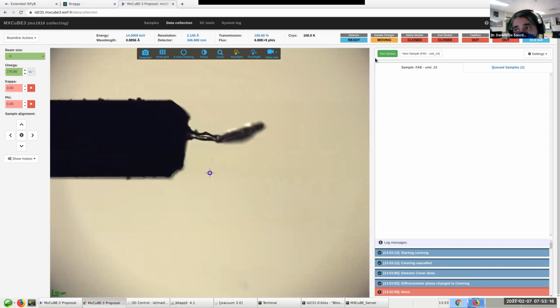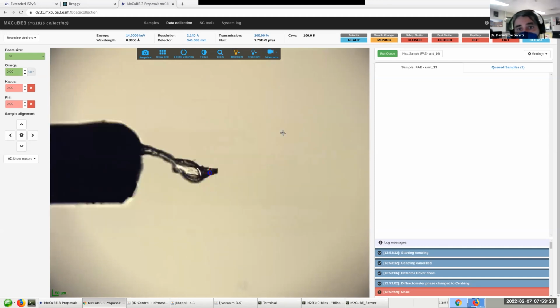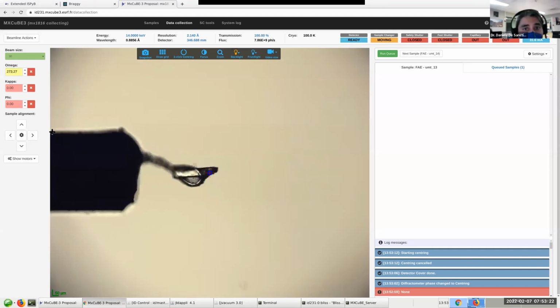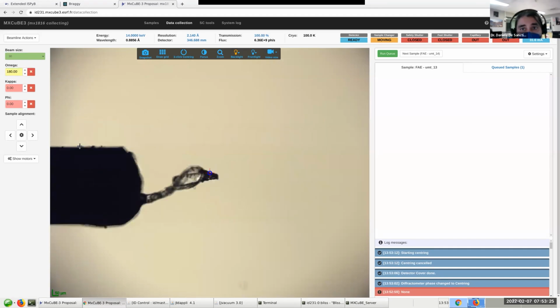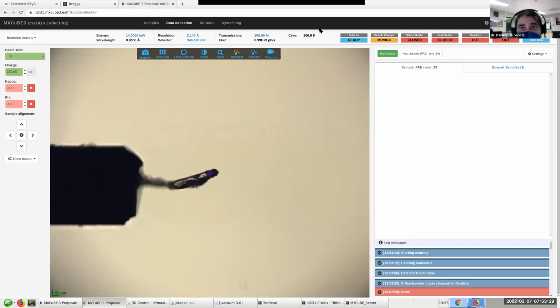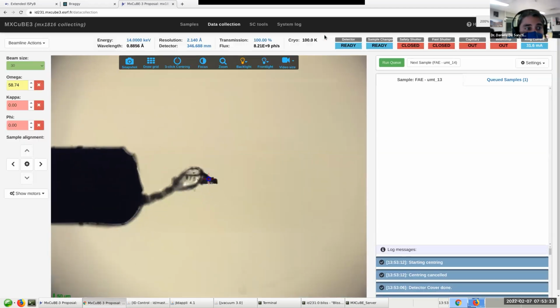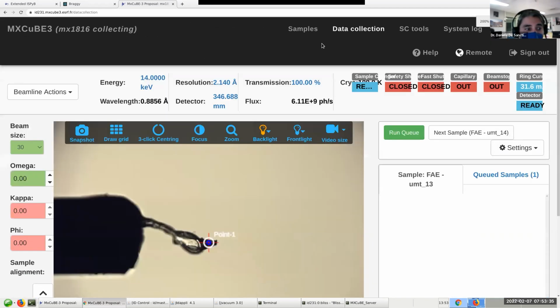The only thing that we recommend is that when you're working on a small screen or a low resolution one, you zoom the browser to the correct size. So I'll give you an example. If I control-scroll, you see, that's too much.